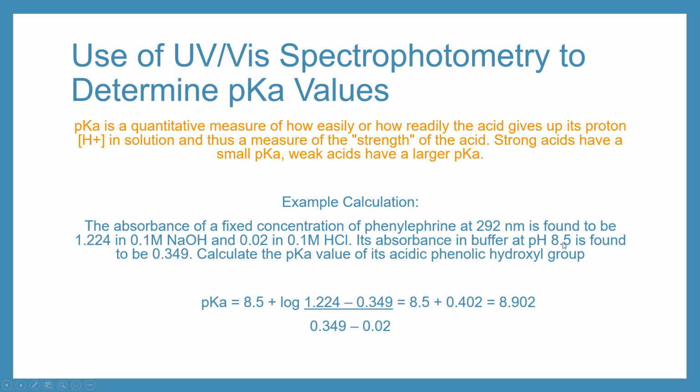Its absorbance in buffer at pH 8.5. We do need a pH value, okay? So this should be supplied to us. So our pH value here is 8.5. And then finally, the measured absorbance was found to be 0.349.